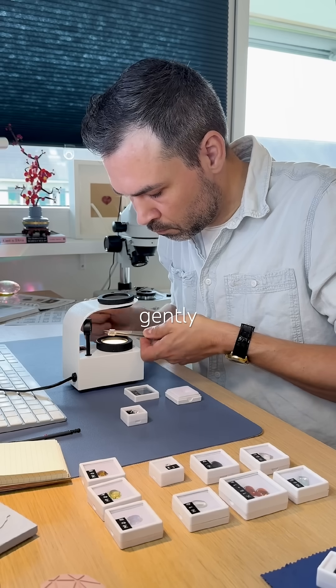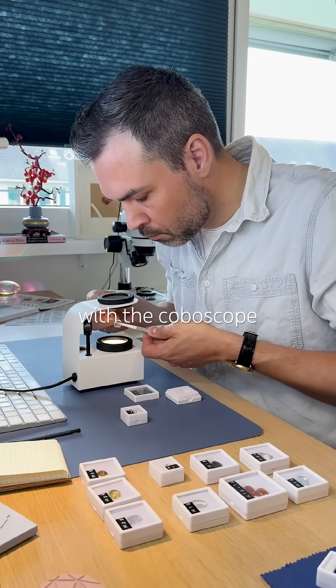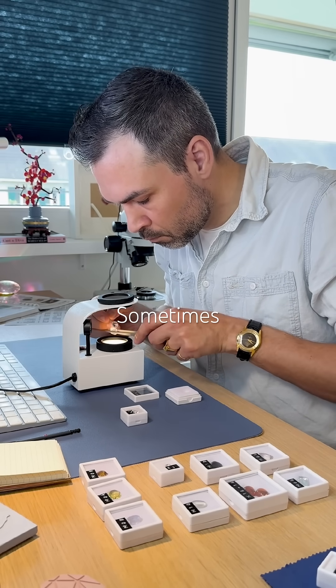If no rainbows, try gently tapping the gem with the conoscope on different spots. Sometimes that's all it takes.